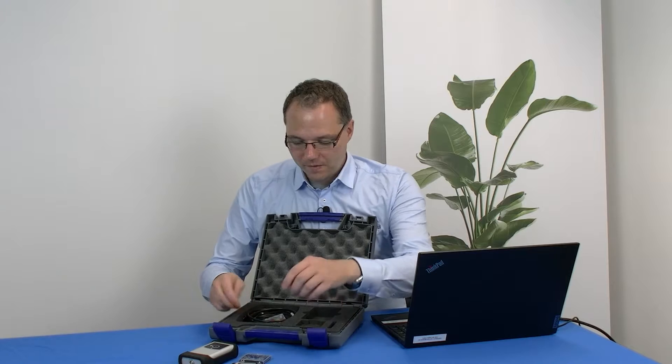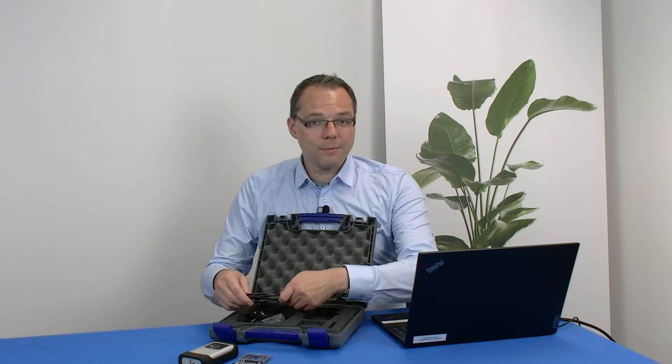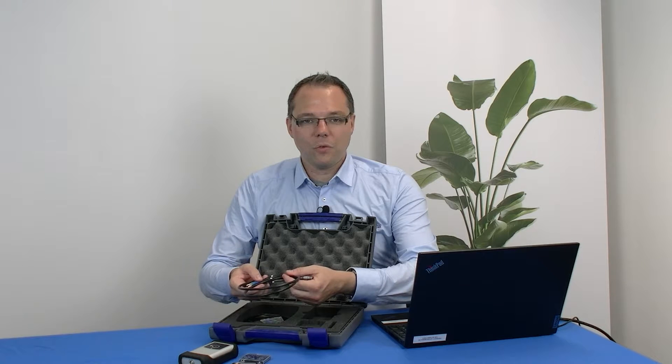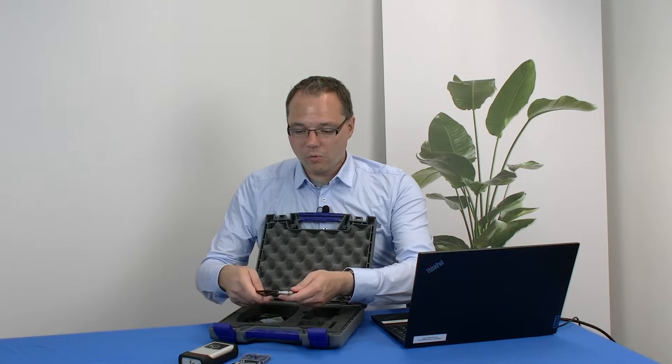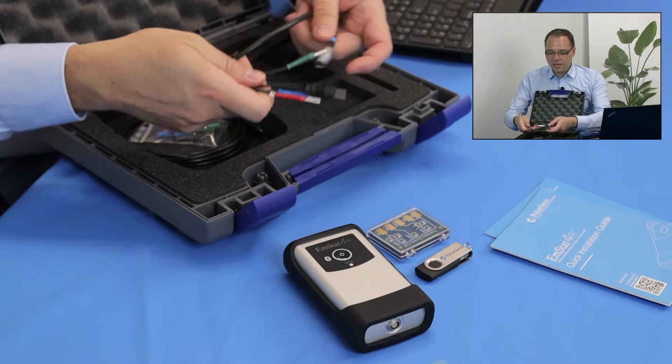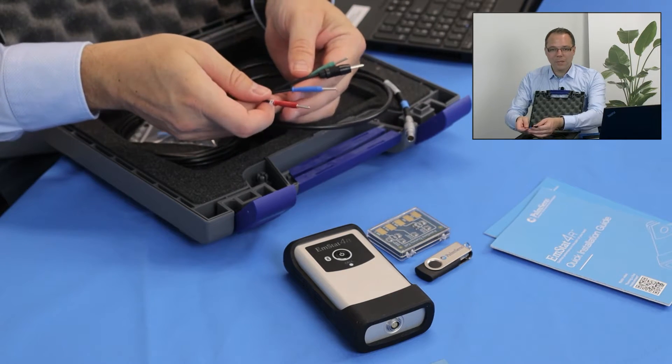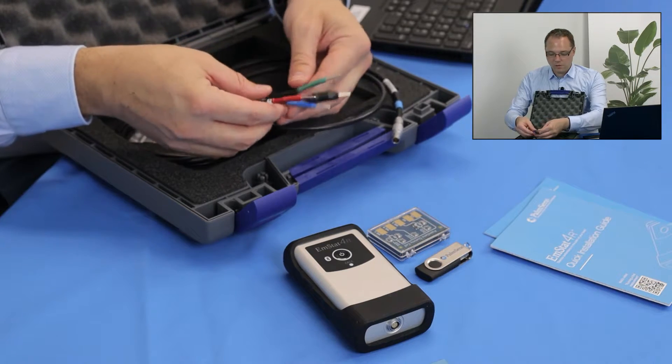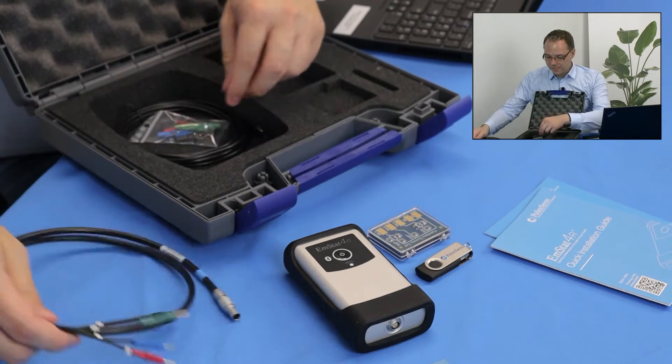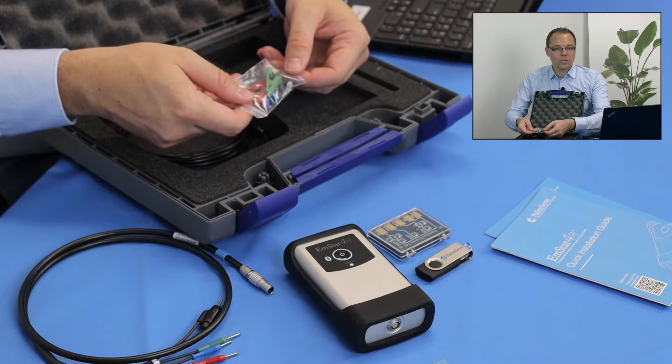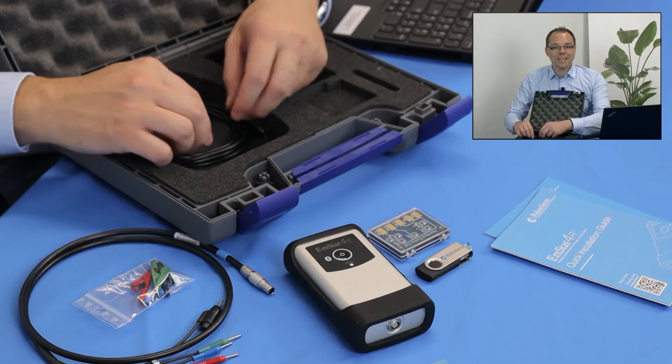Then you will find in there all the cables you need. One is the cable for your electrodes. So on one end it has the plug that's connected to the potentiostat and on the other one it has banana plugs two millimeter to connect to the electrodes. Not all electrodes have receptacles, so you also receive the matching crocodile clips to connect basically to almost any electrode you like.